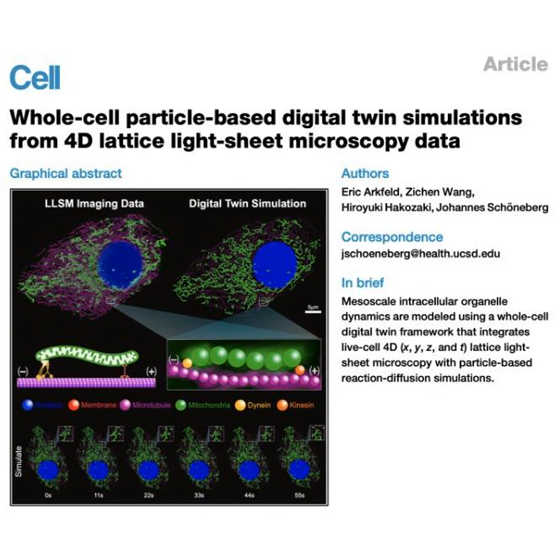LLSM. Okay, how is that different from the harsh spotlight? Instead of blasting the cell from the top down, LLSM illuminates the sample from the side with a microscopic, ultra-thin sheet of structured light. It essentially sweeps through the cell optically, slicing it with this incredibly gentle light. Slicing it with light? That sounds like sci-fi. It really does, and it captures a full 3D volume every single second, with minimal photo damage. Wow, so it's capturing 4 dimensions, X, Y, Z, and time, without frying the subject.